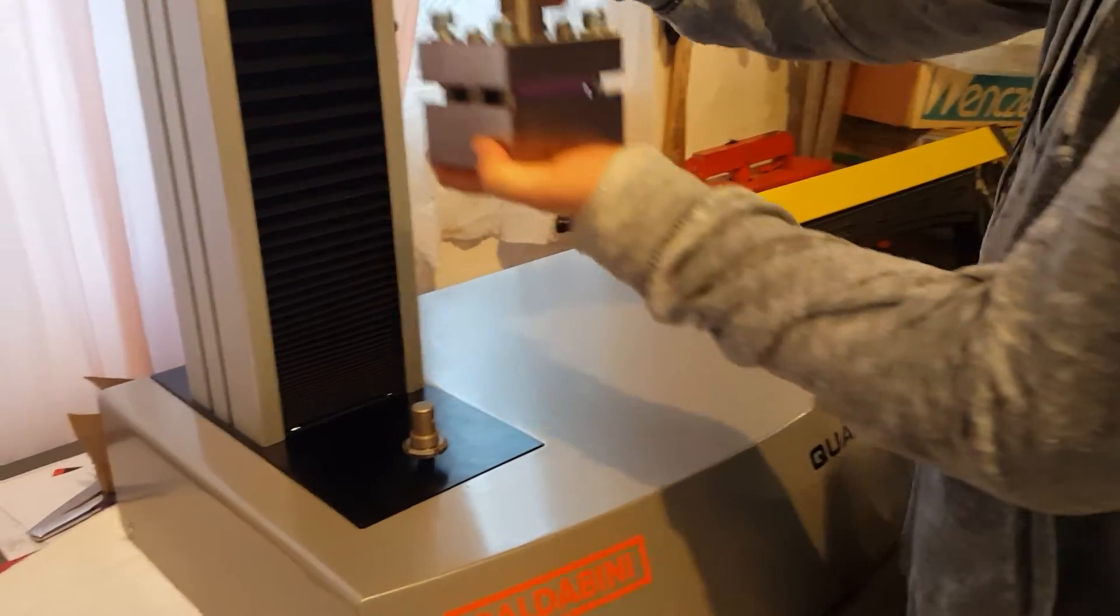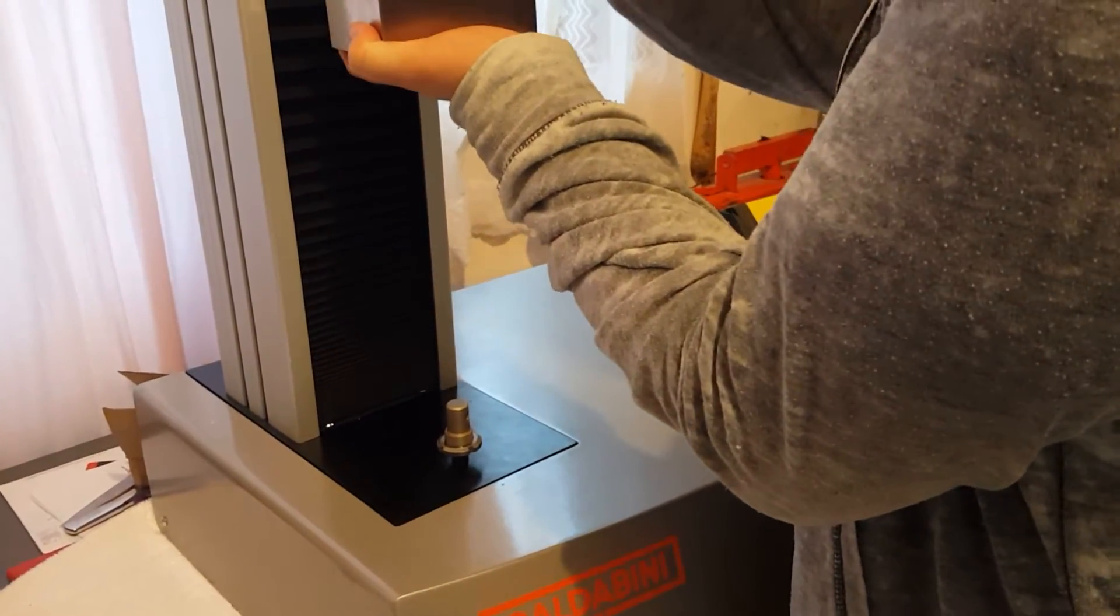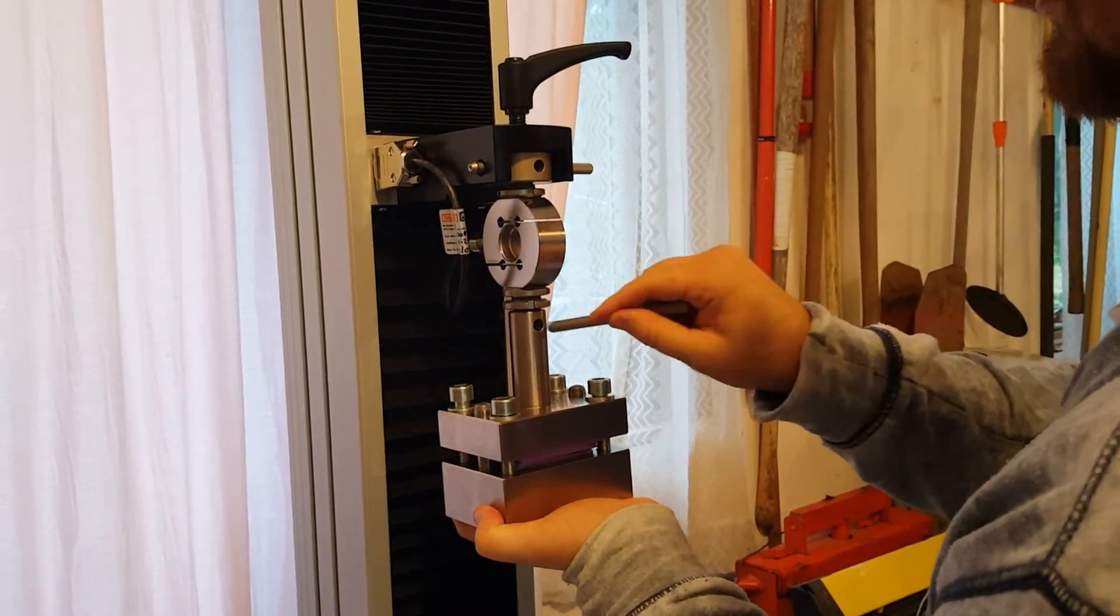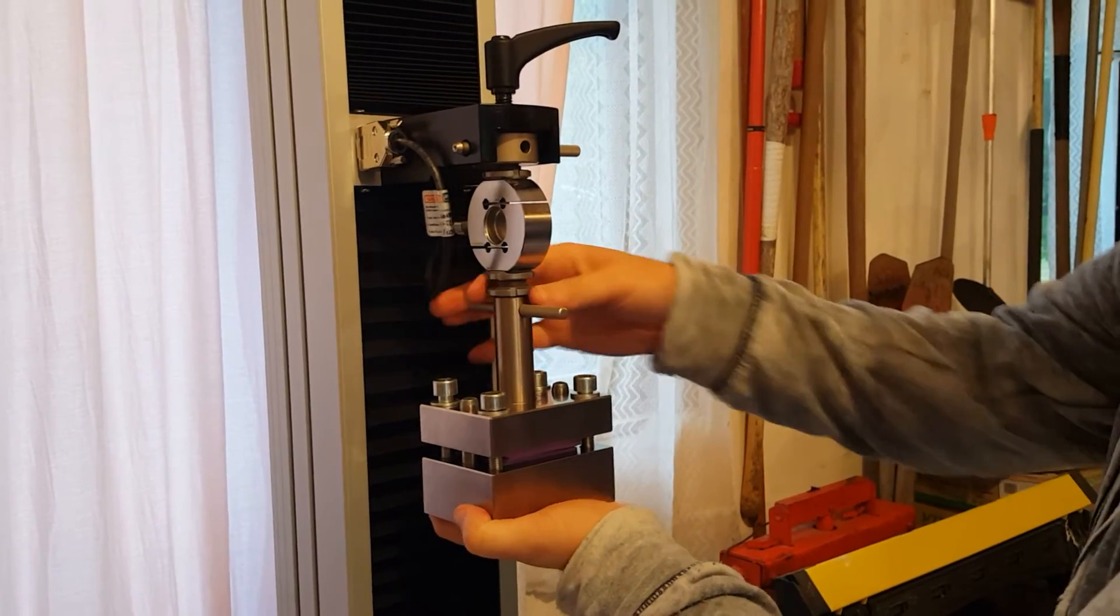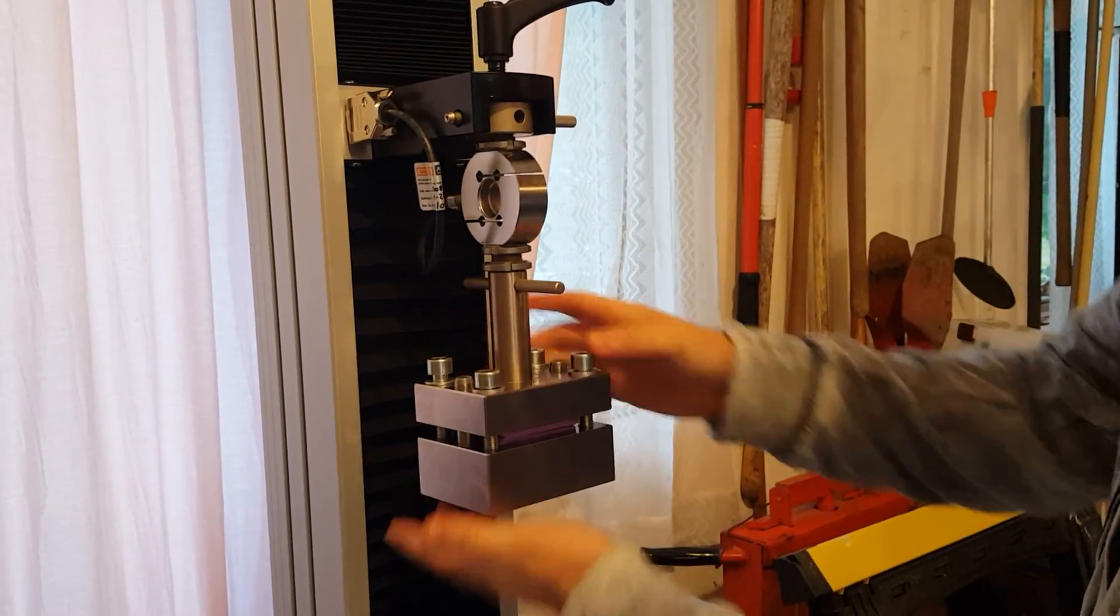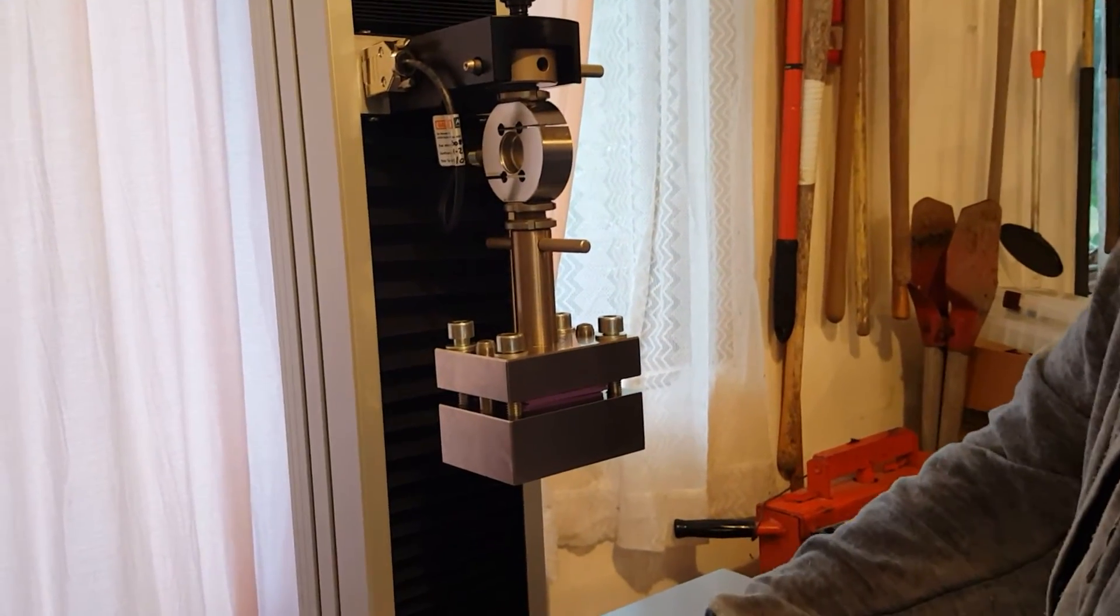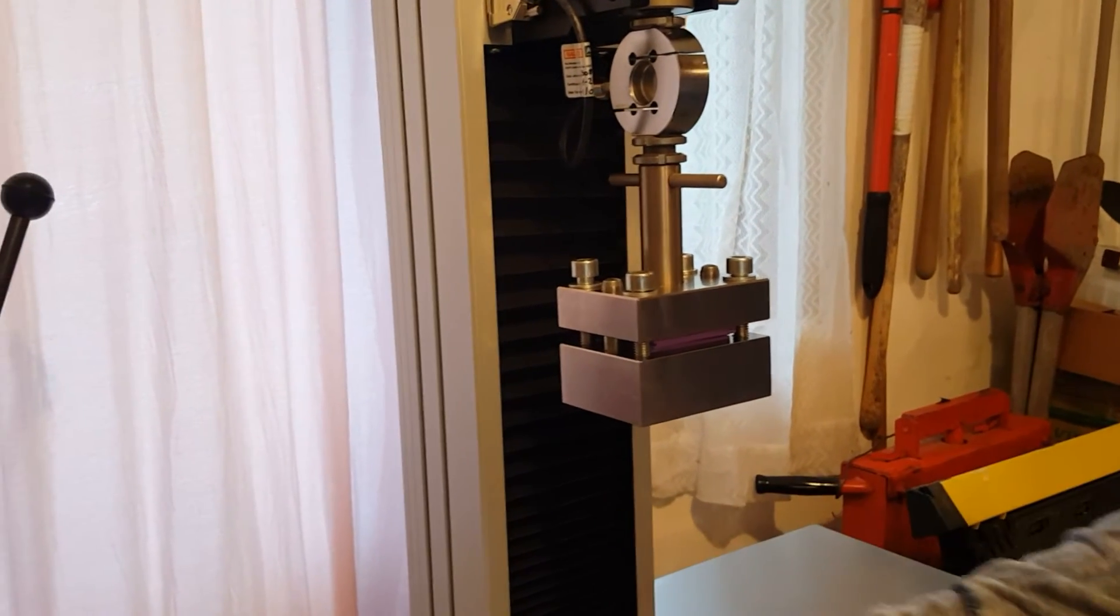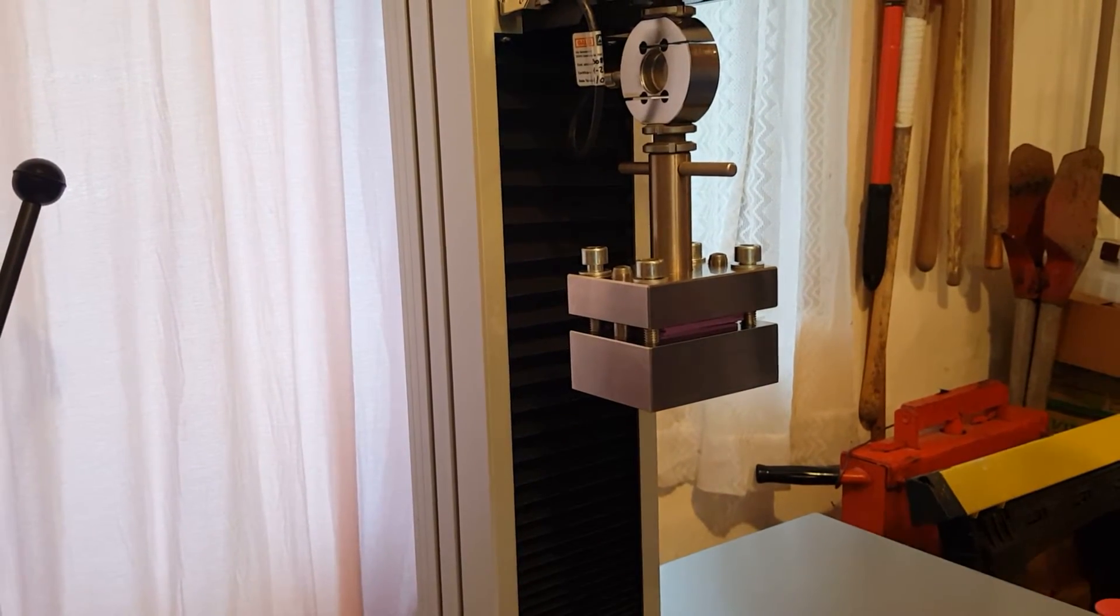What we're going to do is place it onto the top adapter here attached to our load cell. Tighten down that jam nut so we have a nice secure connection. That should hang. We're going to go ahead and remove our bottom adapter so it's a nice flat base here.